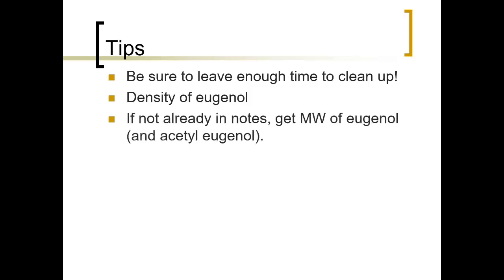So when you're done, you're going to notice that your oil is going to go and eventually float on the top of the water, and that's because eugenol is less dense. The eugenol is less dense than water.